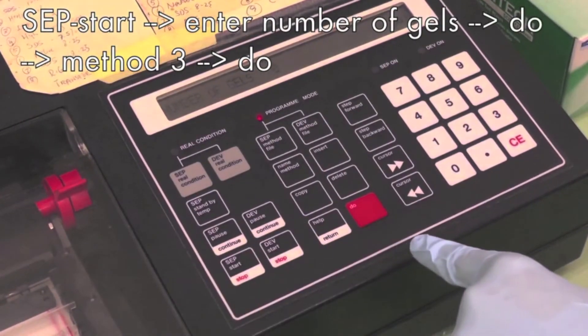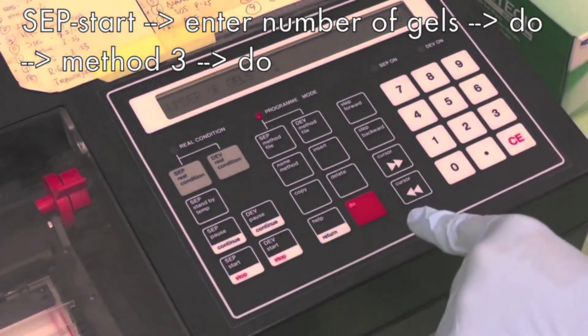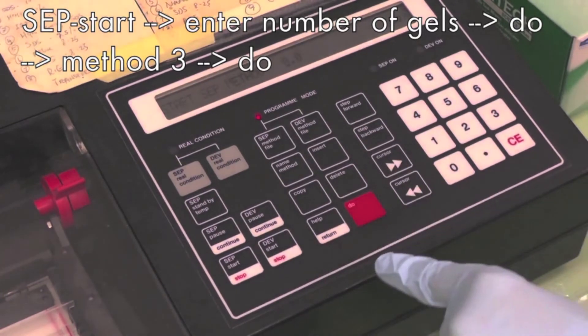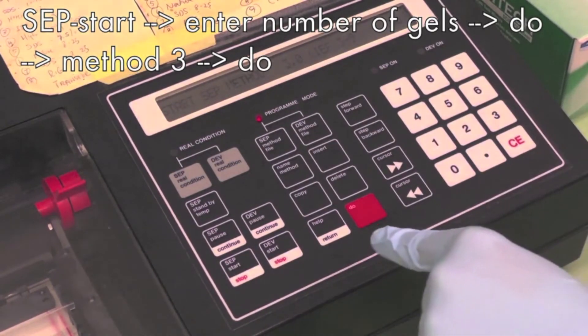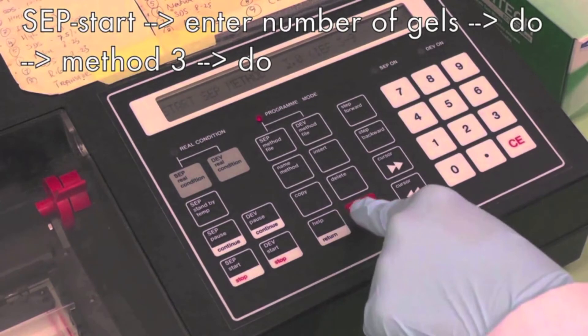Press sep star 1 or 2 representing 1 or 2 gels and then do. Then press 3 representing IEF 3-9 then do to start the run.